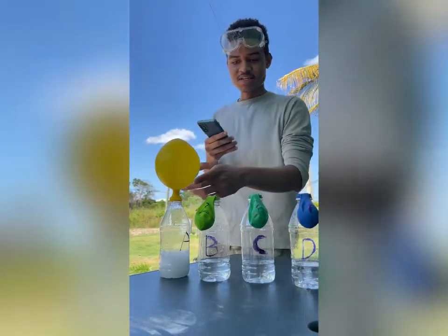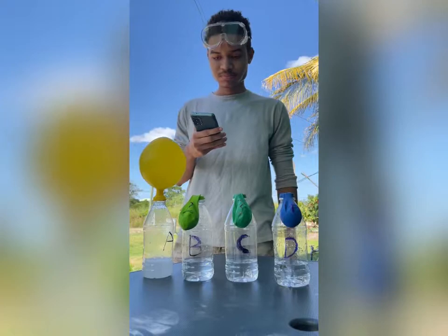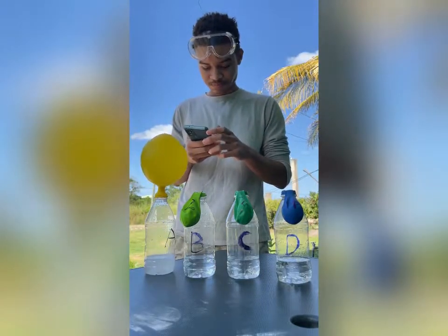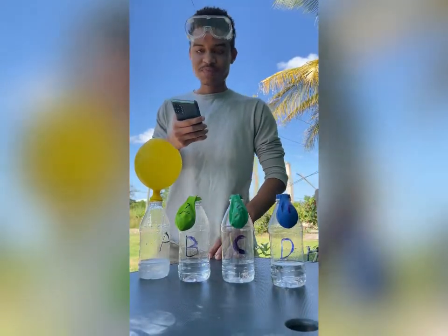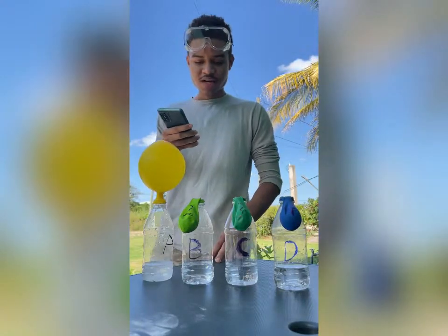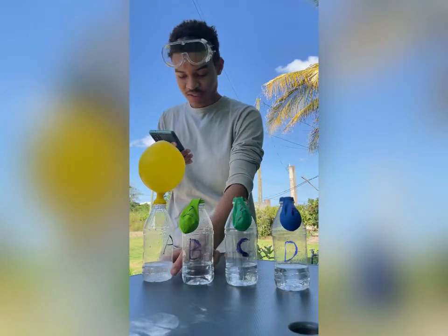As you can see, the balloon 1 on bottle A is expanding. The gas being formed here is carbon dioxide. So this reaction occurs in 2 steps. The first is the double displacement reaction. The double displacement reaction occurs when the acetic acid reacts with the sodium bicarbonate. This forms sodium acetate and carbonic acid, which we saw was forming.